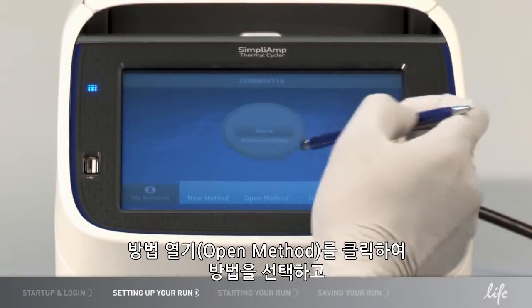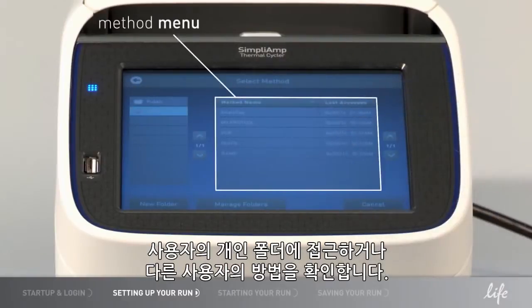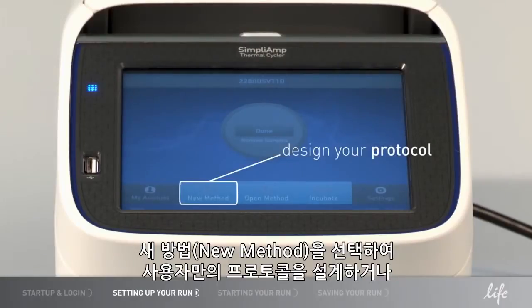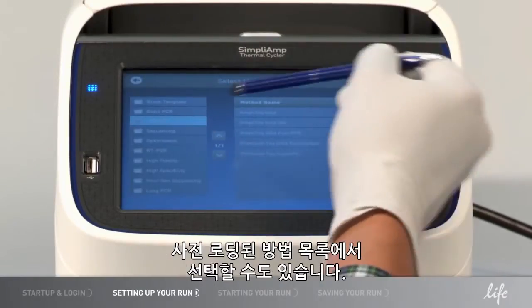Select a method by clicking Open Method to access your own personal folder or look at methods from other users. If you don't have method files yet, you can select New Method to design your own protocol or choose from a list of preloaded methods.